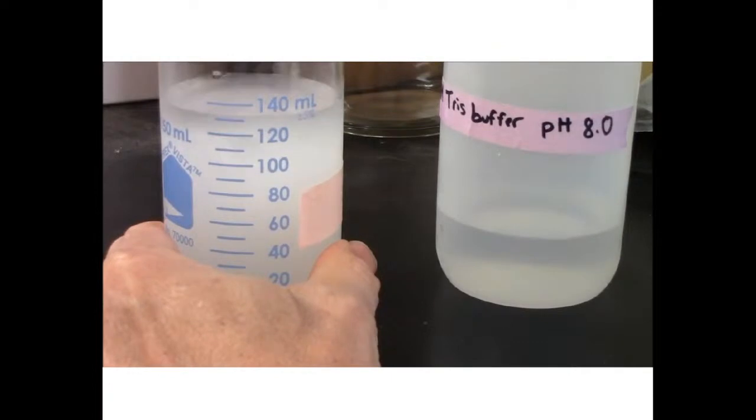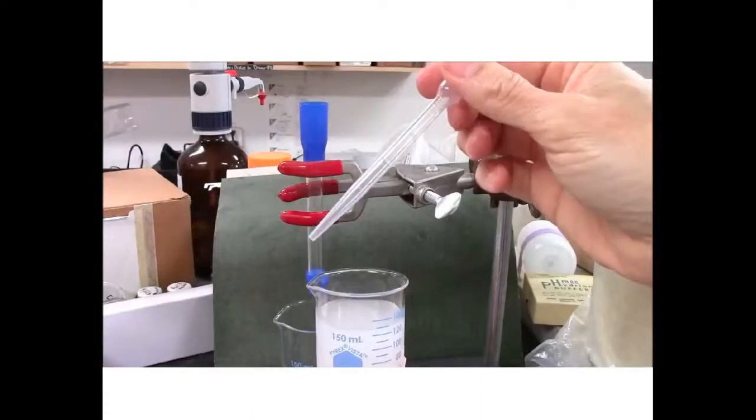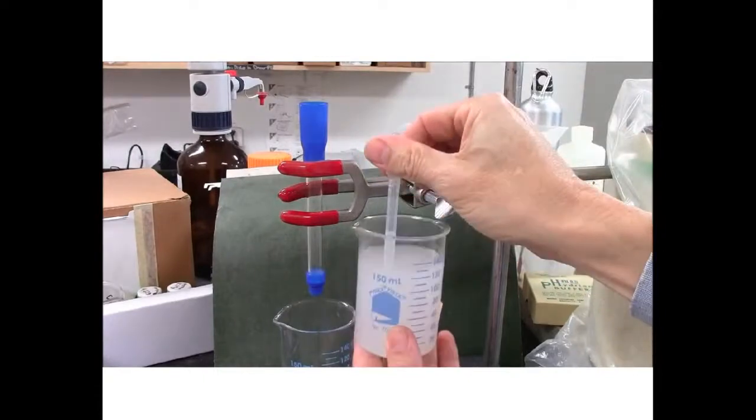It's important not to stir this too vigorously. Don't mechanically stir this. That can break your gel particles up into very fine dust, which will impede your flow rate in the column. So this is making a slurry. I'm using a sawed-off pipette to transfer my slurry to the column.